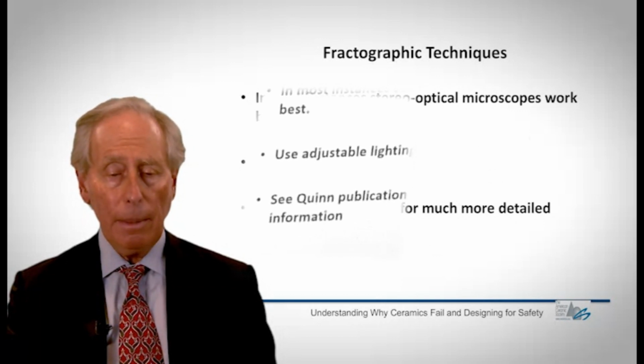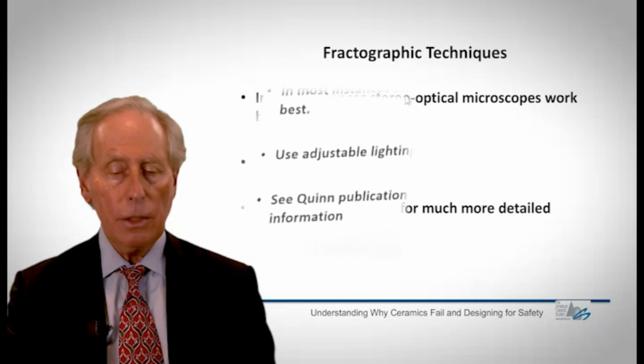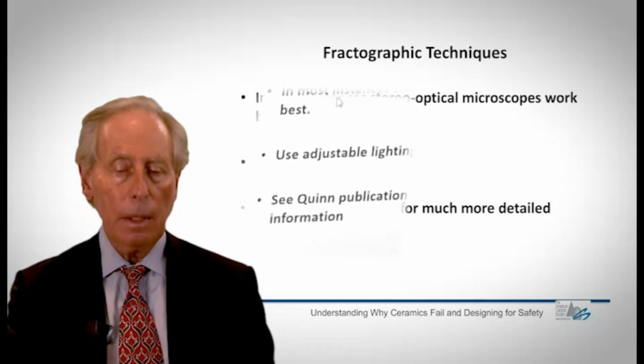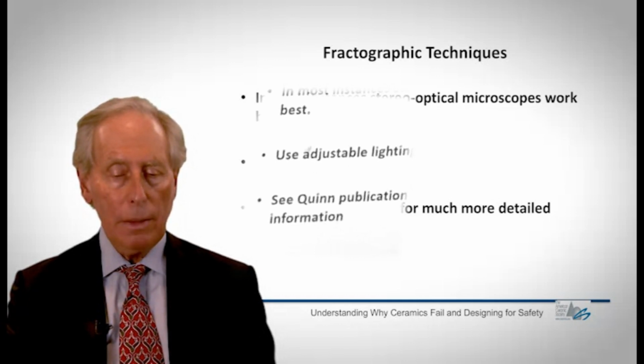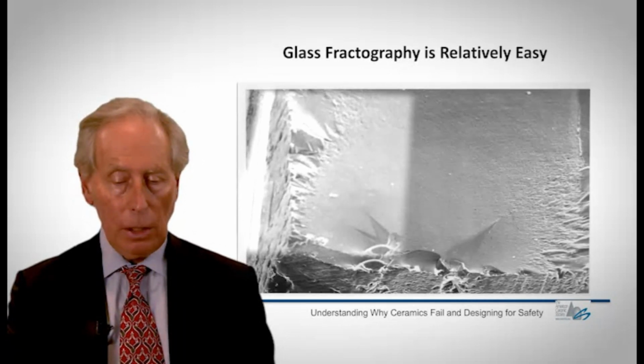And the way to look at them, for the most part, is in optical conditions. A stereoptical microscope works best. Again, refer to the Quinn Guide to Practice. Use one with adjustable lighting, and again, there's a lot more detail available out there. And let me give you an example. I think I showed it briefly earlier.